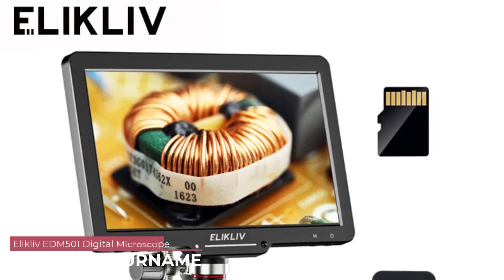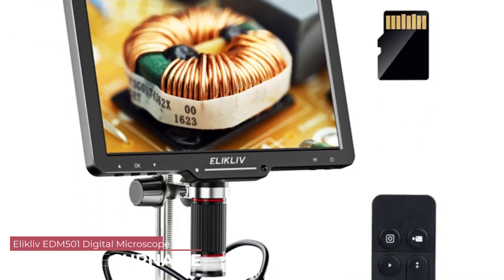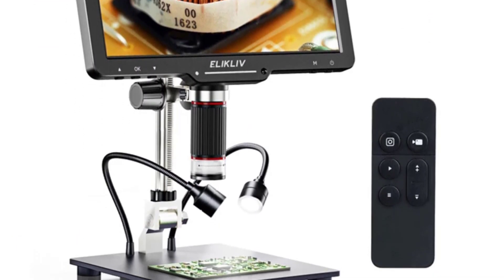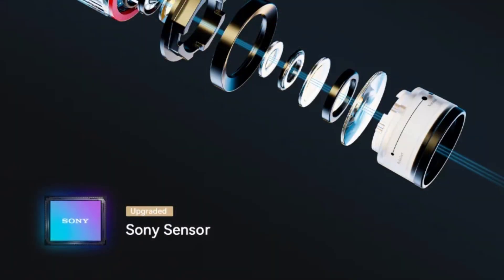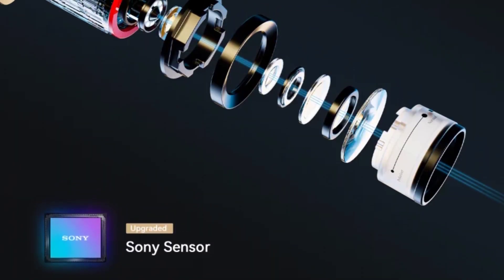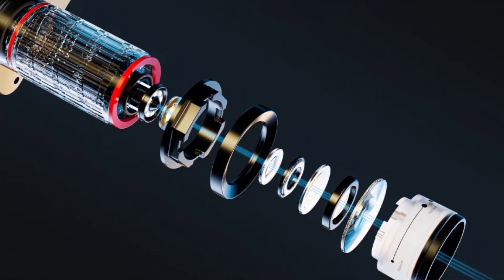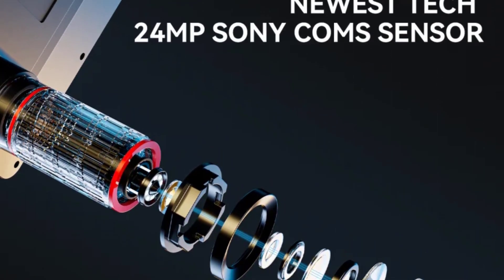Number 1: Elikliv EDM-501 Digital Microscope. The EDM-501 boasts a sleek and portable design, making it incredibly easy to carry and use on the go. The plastic construction feels sturdy, and the black color adds a touch of sophistication. The monocular drawtube is comfortable to use and offers a real angle of view of 178 degrees, providing a user-friendly experience.